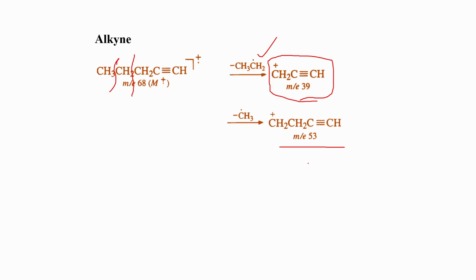Okay. Then there is a possibility for McLafferty rearrangement as in the case of alkenes, whereby a gamma hydrogen is abstracted by this unsaturated carbon atom along with bond shifting with beta cleavage, forming a neutral molecule, ethene in this case, along with the McLafferty rearranged ion, MR ion.